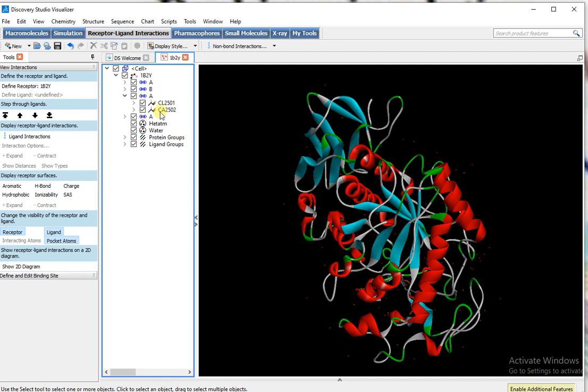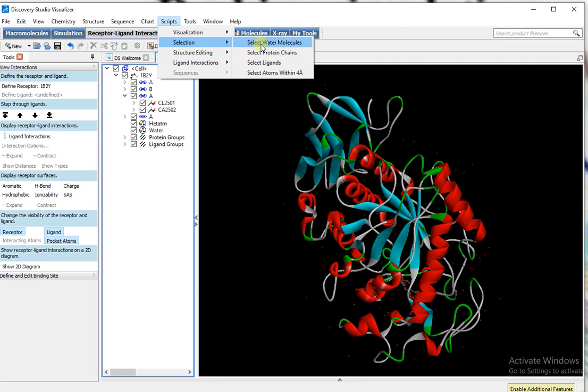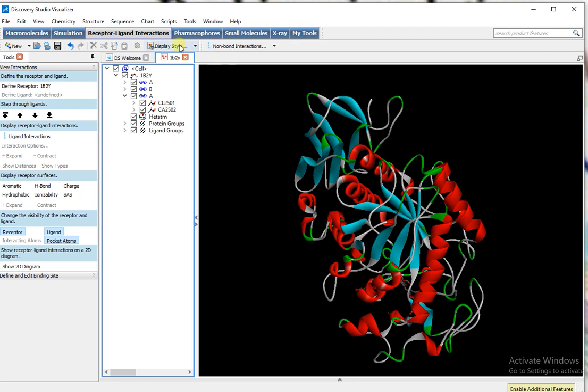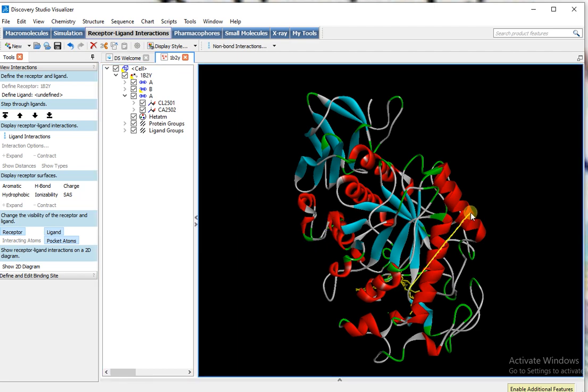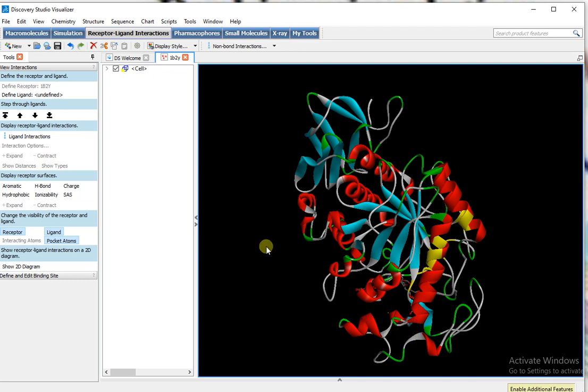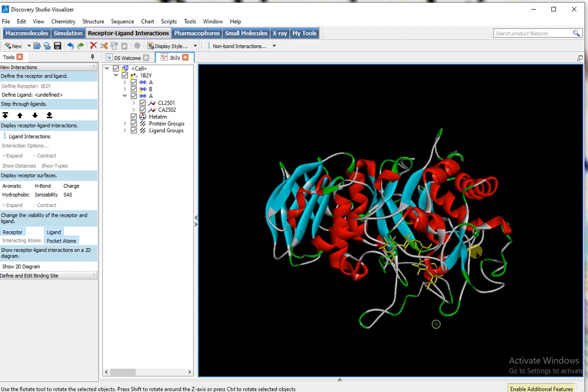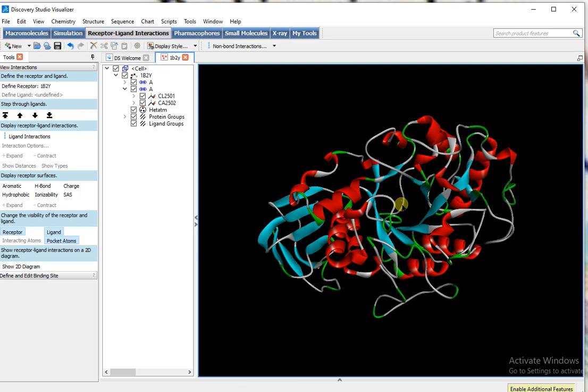ligands that are already attached and also you have to remove water molecules. For this, go to script selection, select water molecules. When water molecules are selected, then simply press delete key from keyboard. Next, go to script selection, select ligand and remove the ligand that is attached. The ligand is selected; I show this by rotating the mouse. Here is the ligand selected; I simply press delete key.